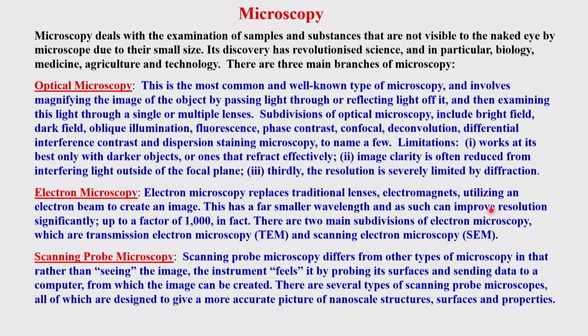So in this particular topic we will be studying basically the electron microscopes and scanning probe microscopy, and in particular atomic force microscopy.